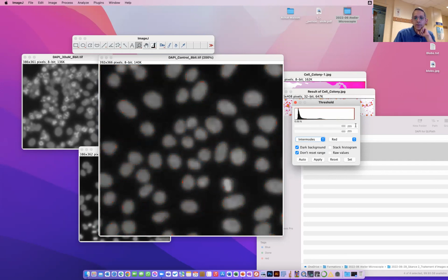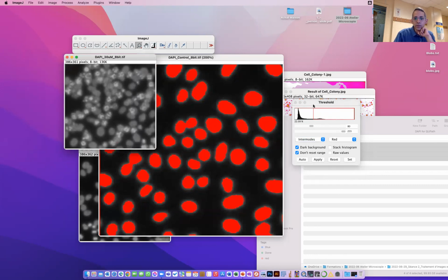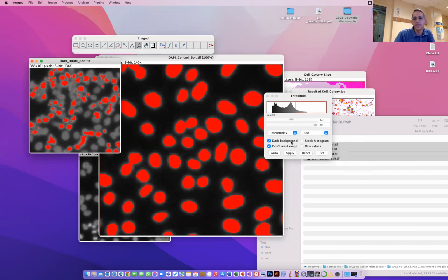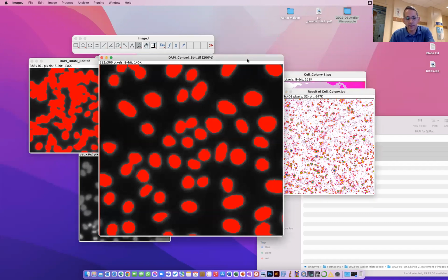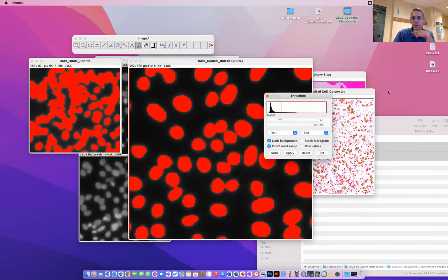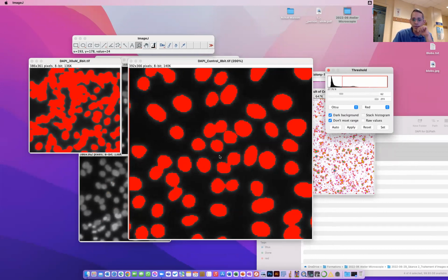If you say, oh, I'm going to adjust it because I can see my cells and I know that I want all of that, and then you go to your controls, to your mutant cells, and say, okay, this is my test cells, I'm going to adjust it, but in this case, I just want this. So you see, this is an experimental bias, because you know what to expect in each condition. If you use an algorithm, it's going to choose for you whatever the algorithm gives as an output, and you can actually have this for both your control and your mutant. And then you can say, I used this algorithm to do my thresholding, and these are the results I obtained for my control, and these are the results I obtained for my mutant.